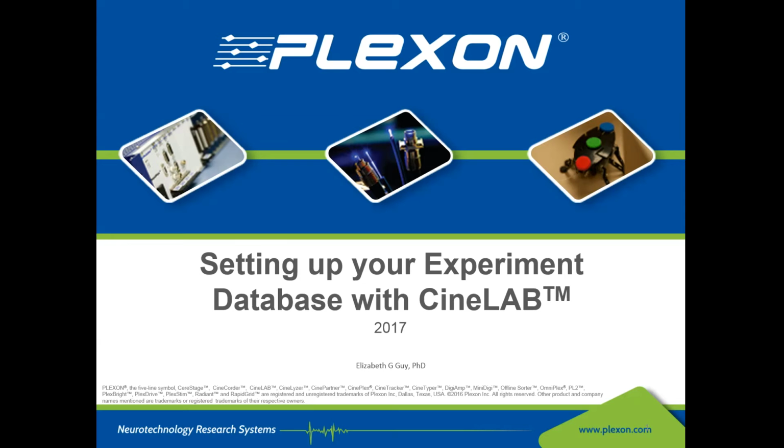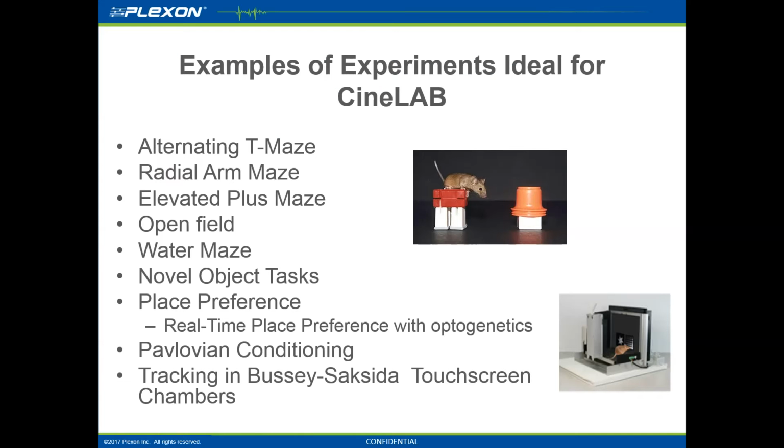Today we will demonstrate how to set up your experiment database to begin recording sessions in our CineLAB video tracking software. CineLAB is Plexon's latest video tracking software designed for tracking and analyzing data from multiple subjects and experimental groups for behavioral research.